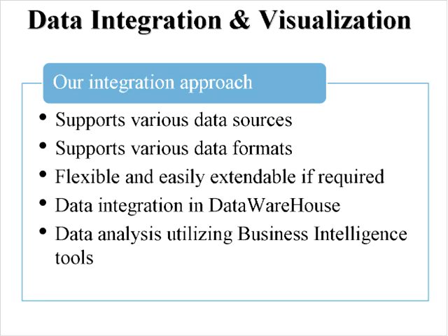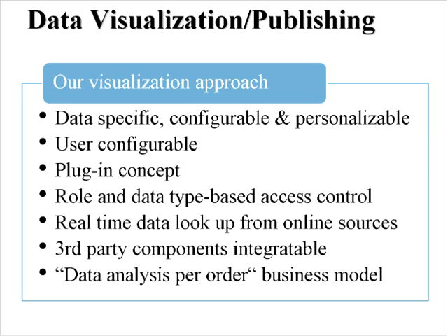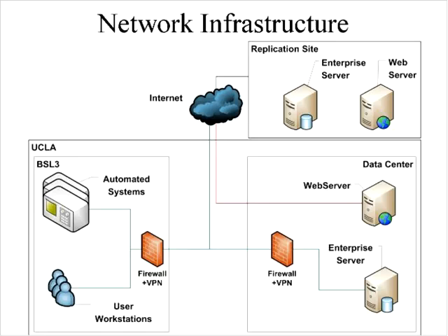In terms of data integration and visualization, again, I think this is an important core concept, which is that the data integration and visualization be integrated within the system that also comprises the LIMS system. And the idea was that it should be able to support various data sources and also be, to the greatest extent possible, plug and play, in the sense that we're not reinventing new modes for data visualization, but rather integrating them within an existing system. Emphasis is on it being as easy as possible for the user to access all of their information coming out of the system through this one portal.